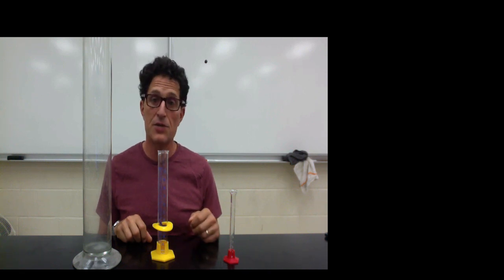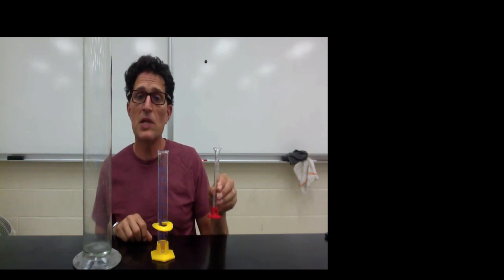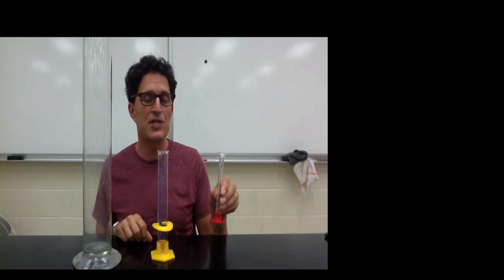In front of me I have three different graduates. I have a 10 milliliter graduated cylinder which measures to 1 tenth of a milliliter of precision.